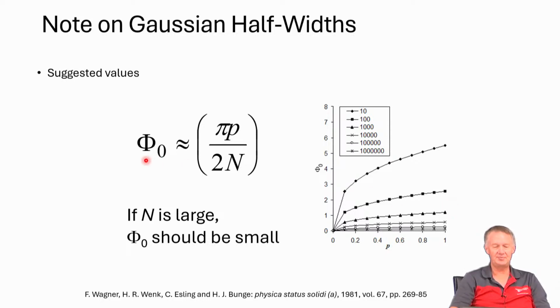And the half width of that peak is going to determine how tight your texture is, right? So if I have really broad half widths, it will tend to smooth out the texture. If it's really narrow and your bins are small, then maybe you'll have a very strong texture calculation. So usually we just try and make this half width small. My choice is I typically use 1 degree.